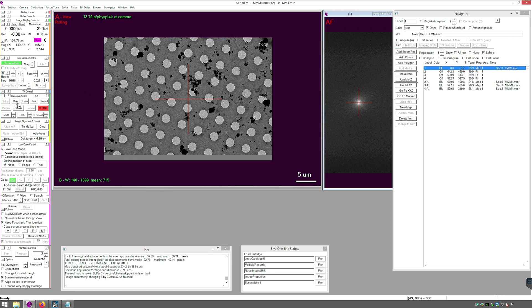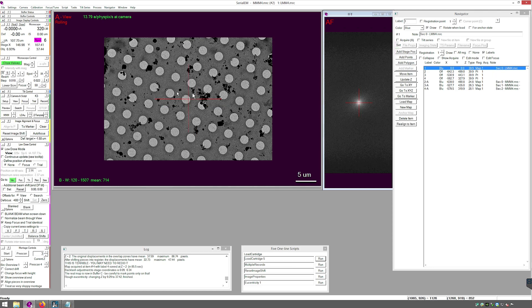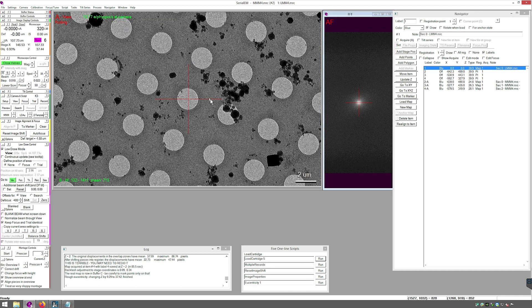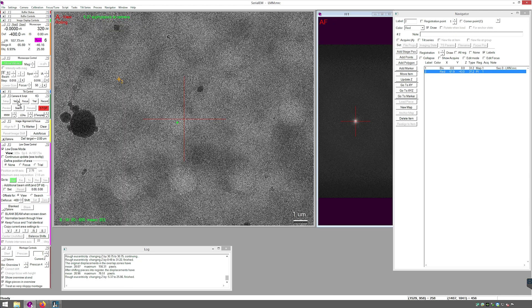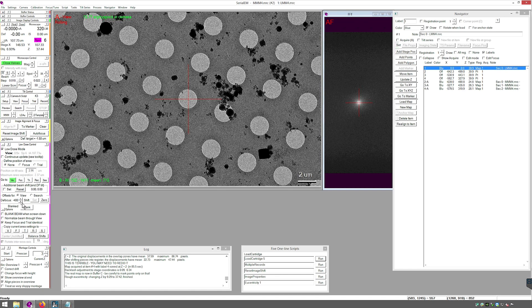Press View and center a hole. Once you have a hole accurately centered, define the focus position. Put the hole centered, define the position of focus, put it in between — that looks good. Reduce the defocus for view to a value between 0 and minus 20. Adjust your hole centering if necessary.